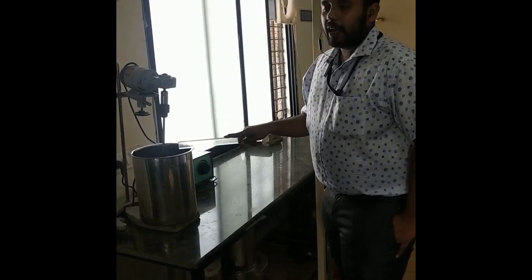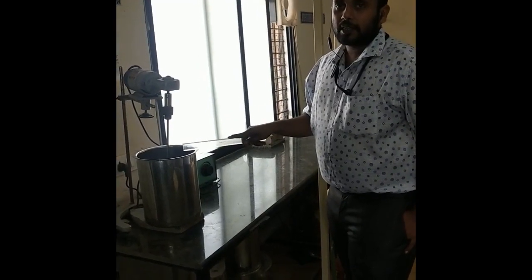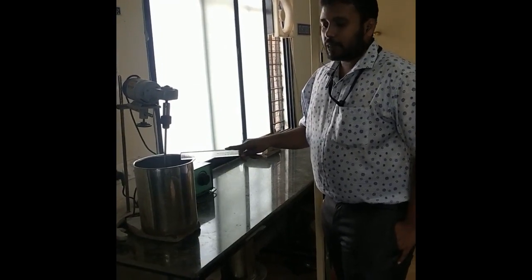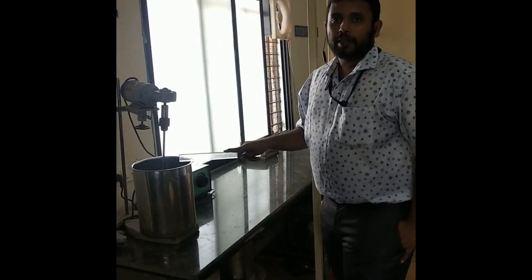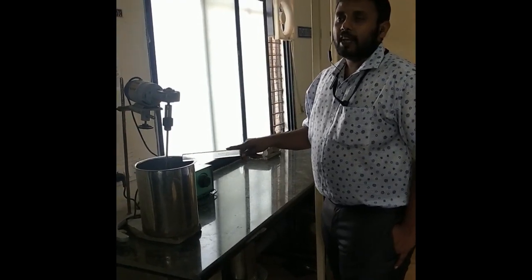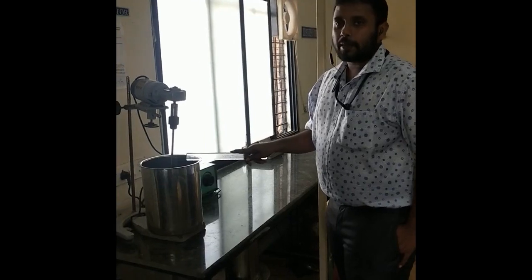As soon as you add 900 ml of NaOH to this vessel, you need to start the stopwatch simultaneously. So once the stopwatch is started, at definite time intervals, that is 5, 10 minutes, 15, 20, 25, up to 60 minutes, we will be collecting the samples.